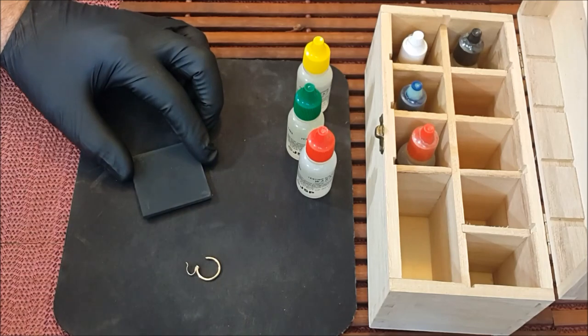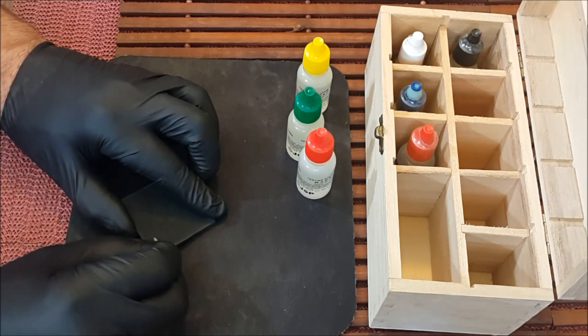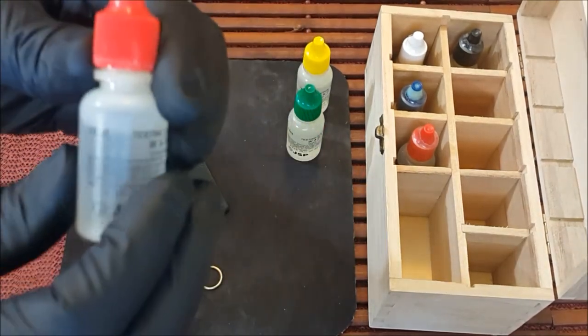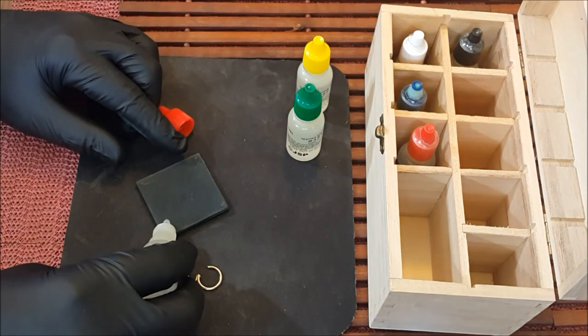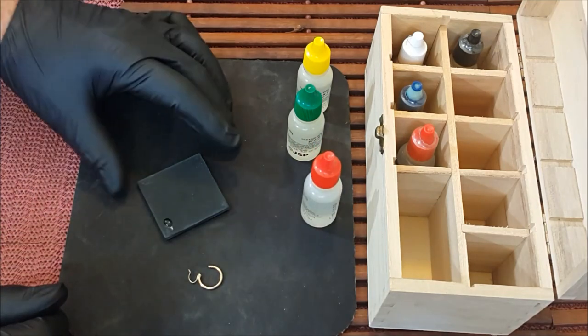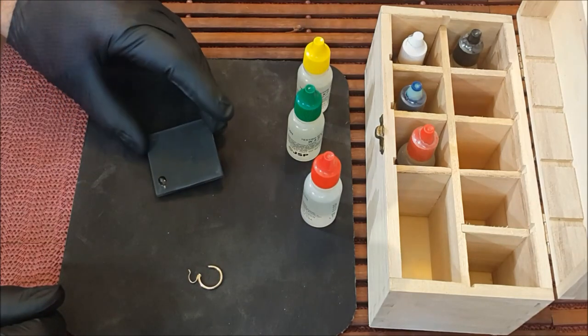Now I wipe the area clean and place another rub sample to see if it will pass the 18 karat purity test. There are different techniques for applying a rub sample — you can make one long rub and do multiple tests on a single rub, or do individual rub tests. Because this piece didn't have any purity marks on it I wanted to validate that it was even gold. The 18 karat test clearly dissolved the gold, confirming that this piece is made from 14 karat gold.